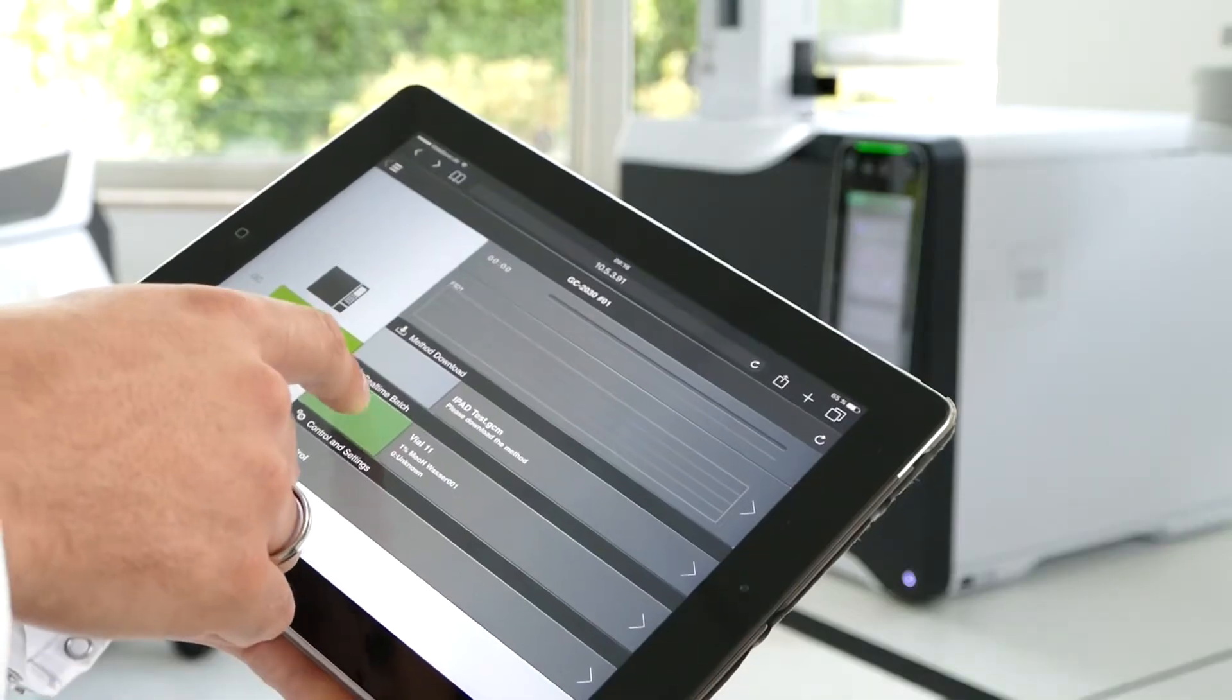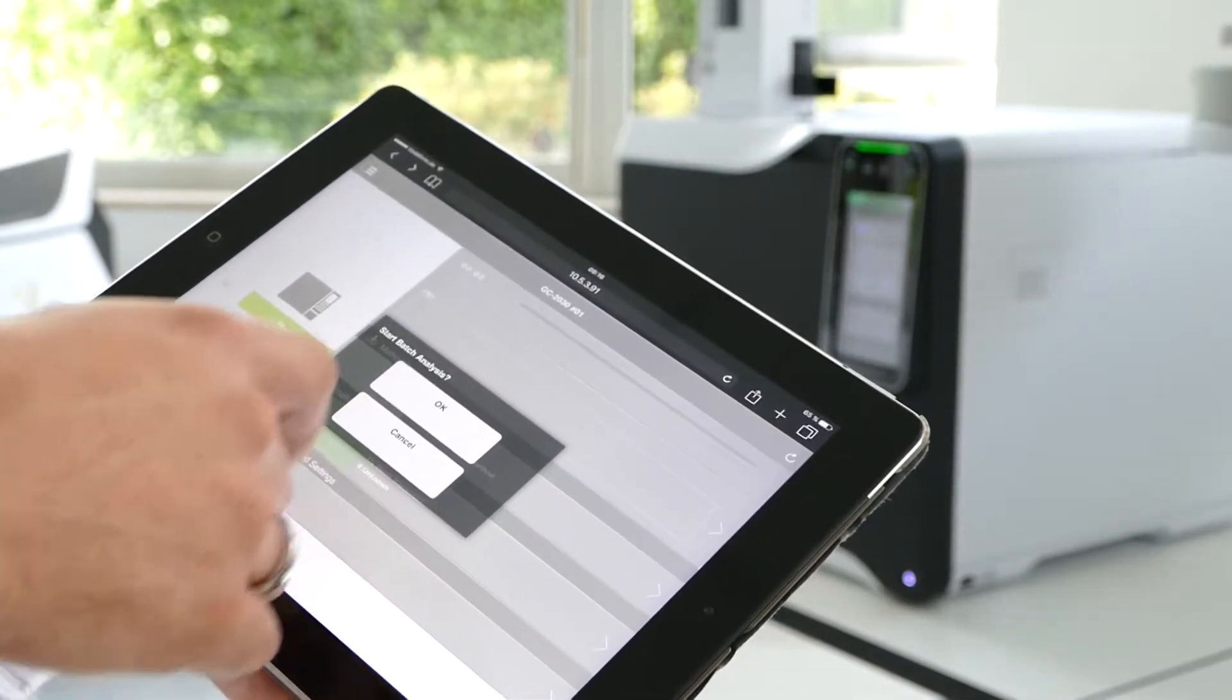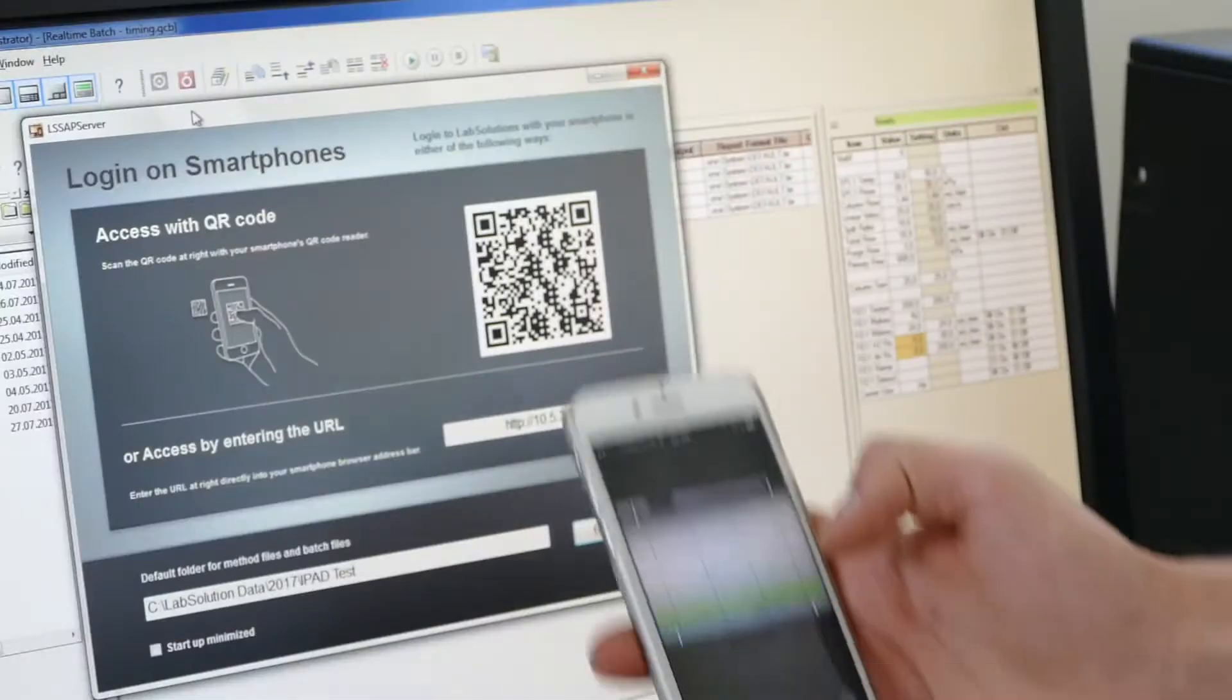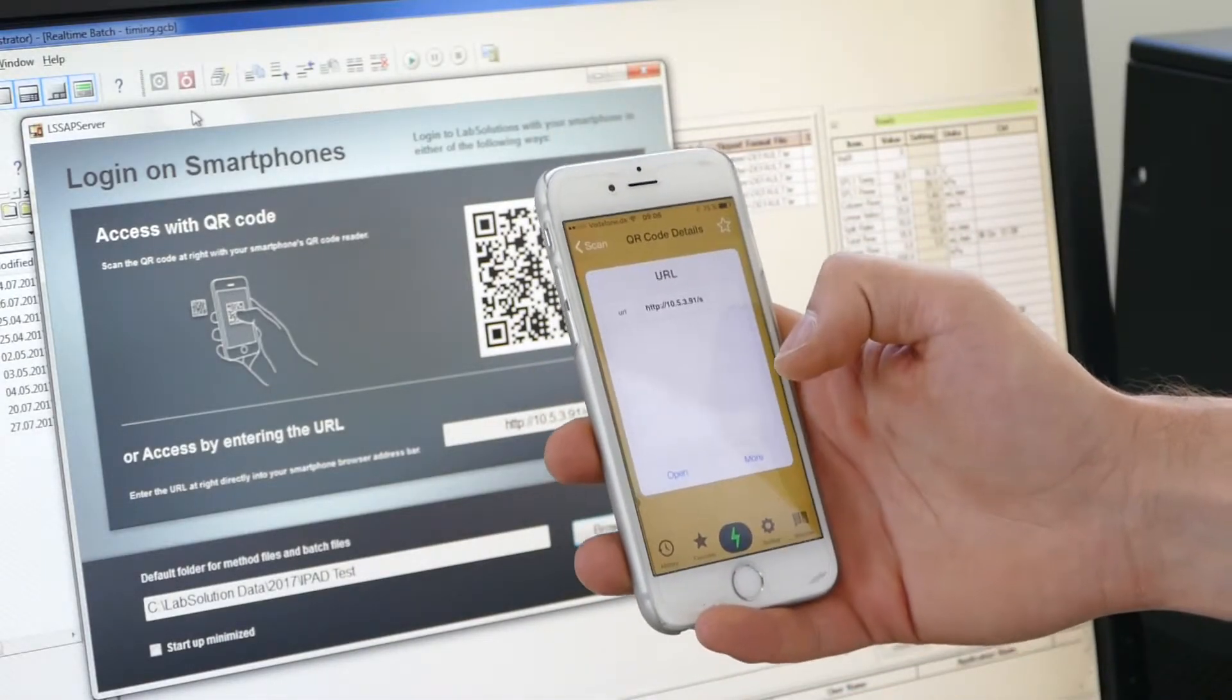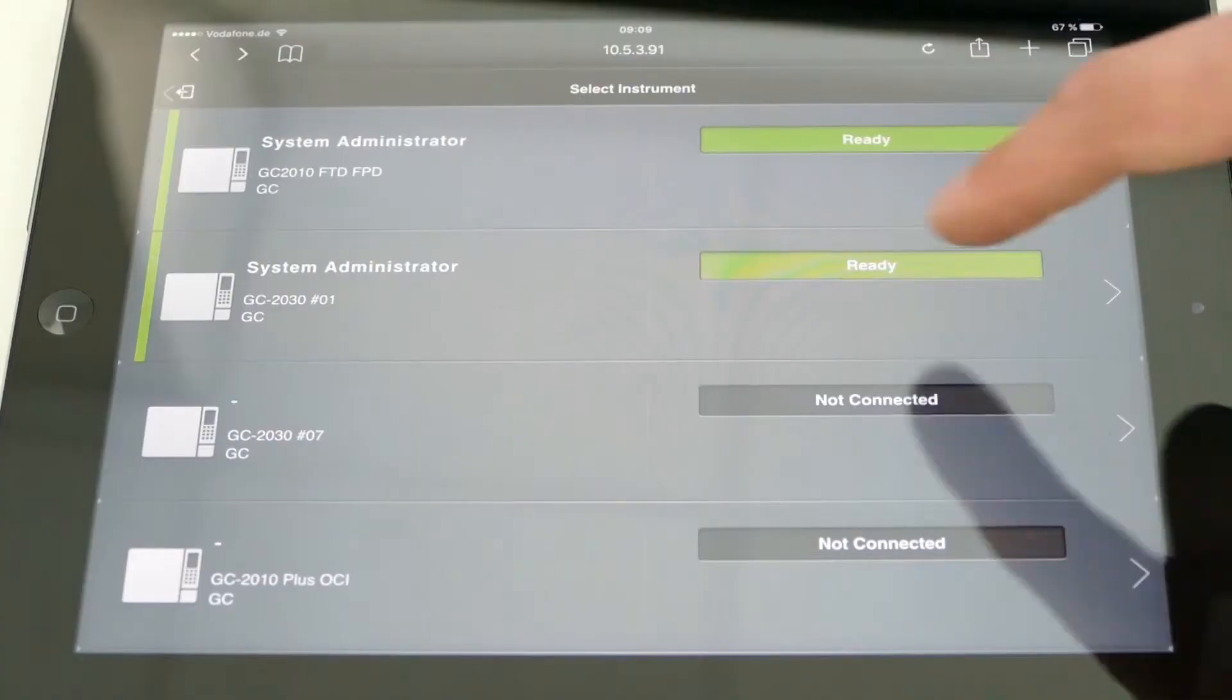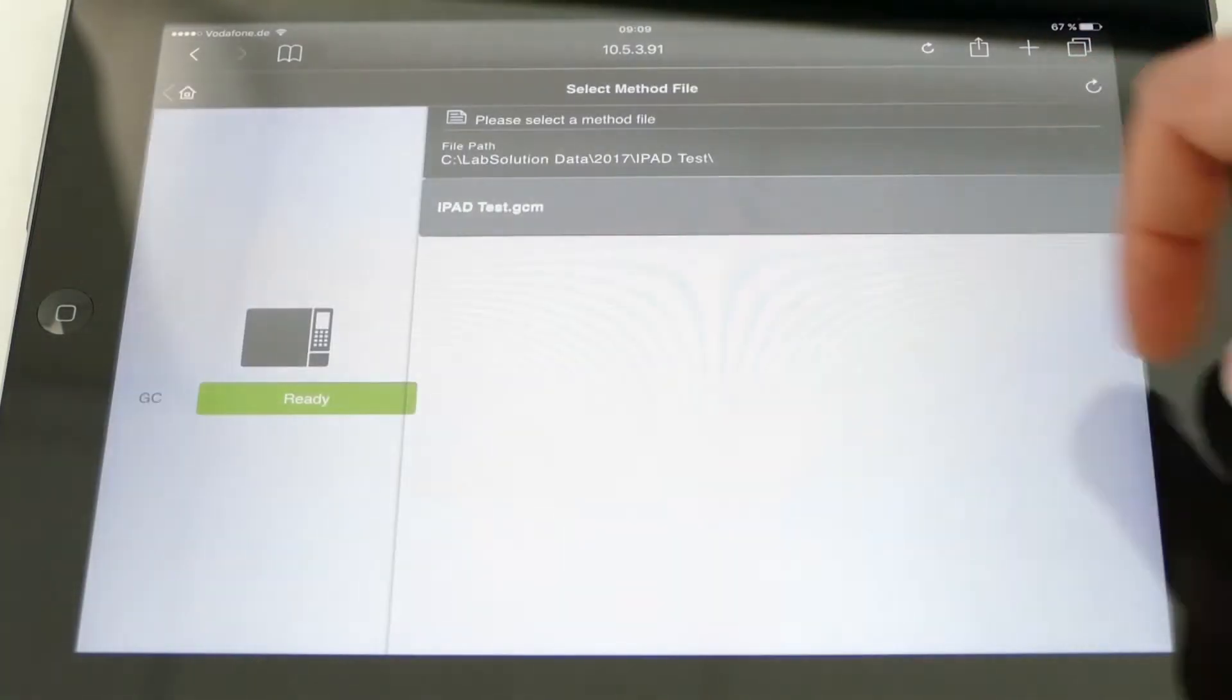With Lab Solutions Direct, it's now possible to follow your GC analysis live on your tablet or smartphone. It's even possible to start a new batch of measurements remotely.